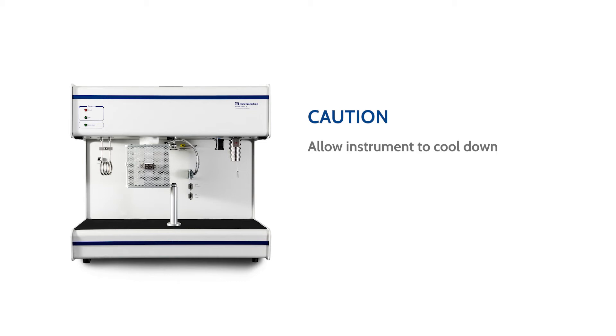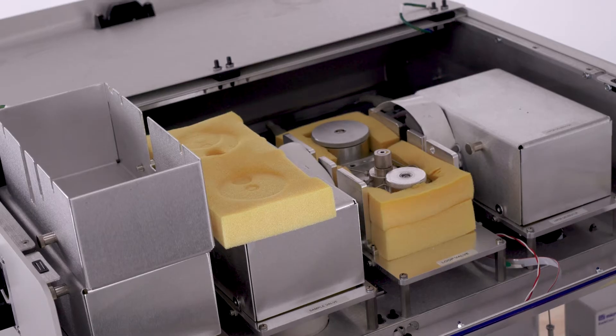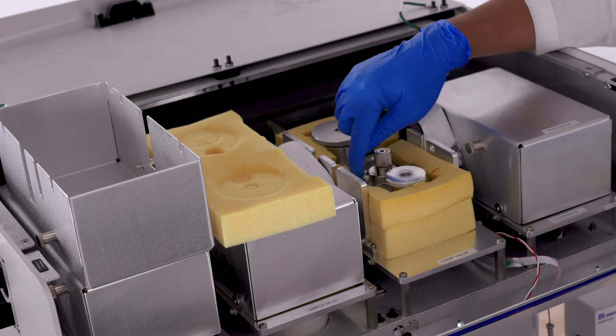Allow the loop valve heat zone some time to cool down. Once cooled, locate the position of the currently installed loop.